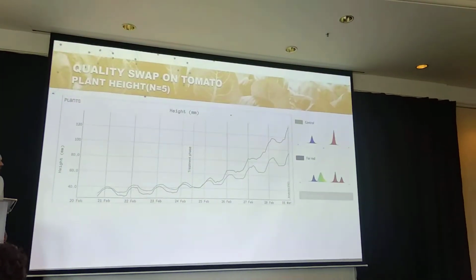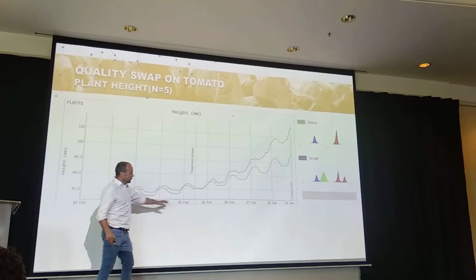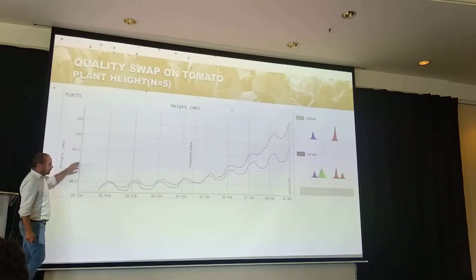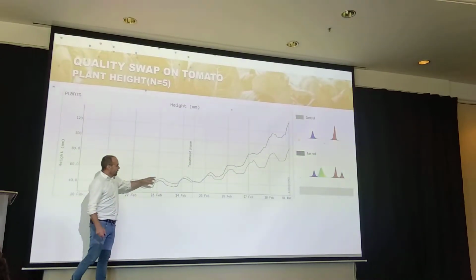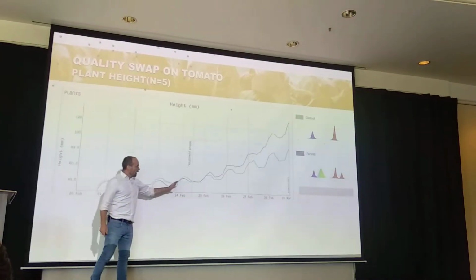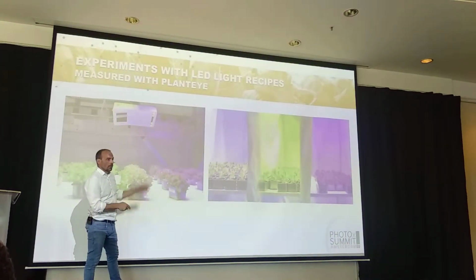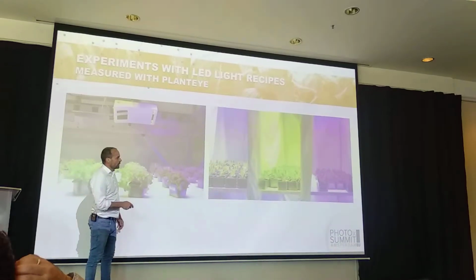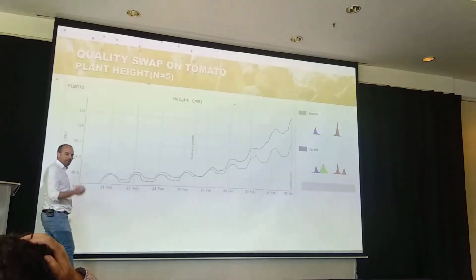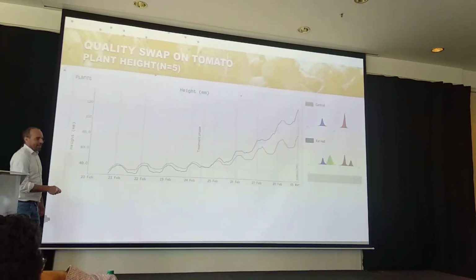So, first result, this is days, I think it's 10 days or so. In this case, it's height, so you see again the pattern, up and down. And by the way, we really separated the plants, we had these curtains.